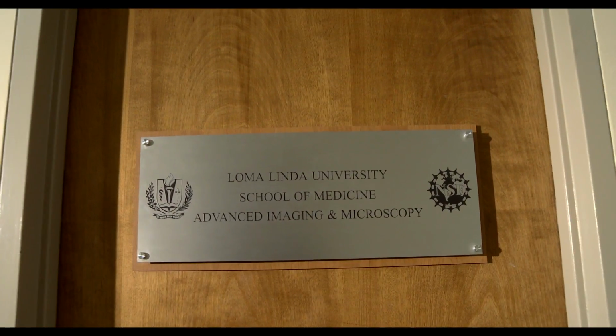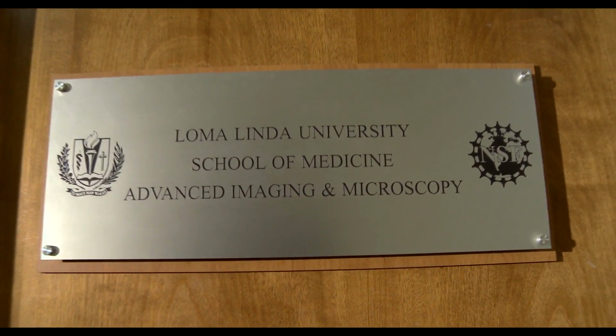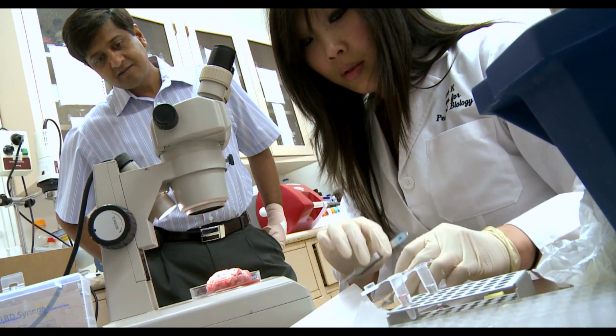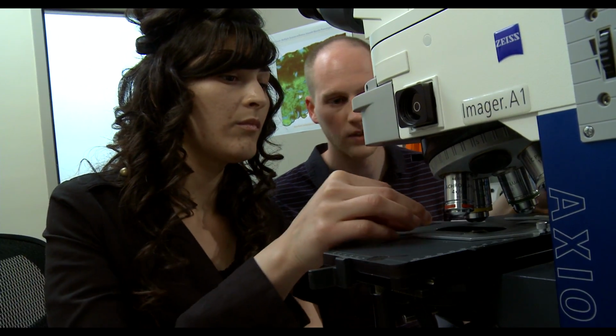This advanced imaging and microscopy core is a powerful tool in advancing science and in helping us change our whole concept of life in the world.